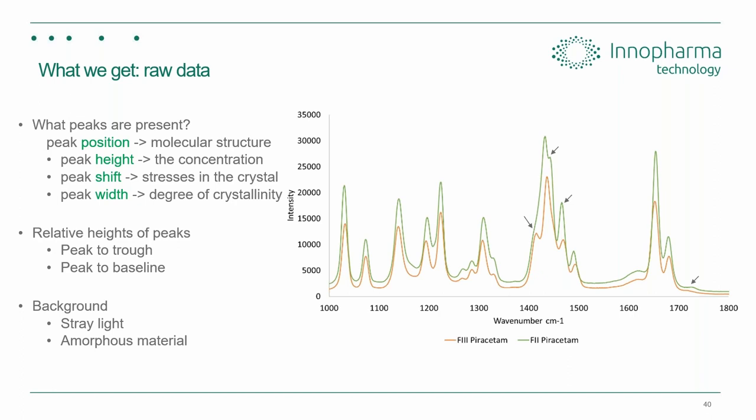And this is why, when we look at signals through glass, we have to subtract the background, because it's got a signal that does not have any peaks, so we have to remove that from the scan. If we were to try and look at the same process through a crystal, we'd find that essentially it is noise. It's signal at all wavelengths, perhaps not to the same intensity, but it is that kind of background produced by amorphous materials being present. It is noise, and for that reason, we have to remove it.